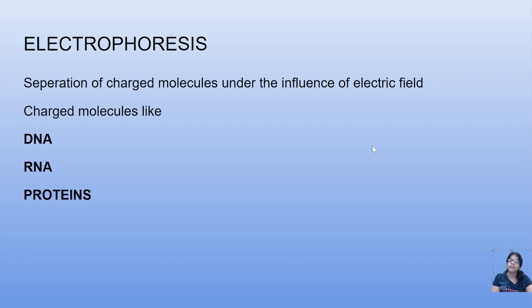So how can the macromolecules or biomolecules be separated in electrophoresis? Let's discuss in this class. DNA and RNA have a relatively negative charge, so it is easy to separate them. When placed under an electric field, they obviously move towards the oppositely charged electrode, right?